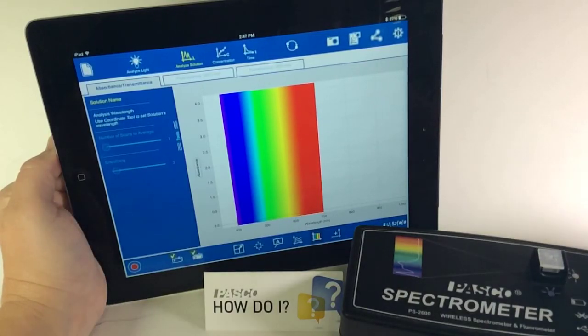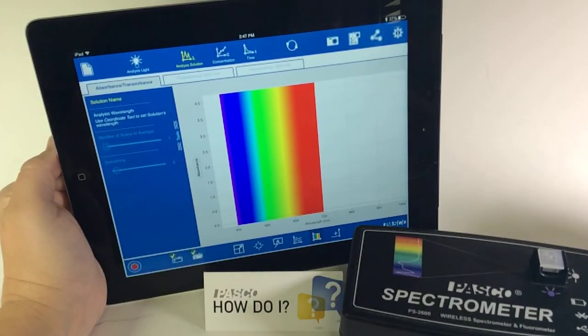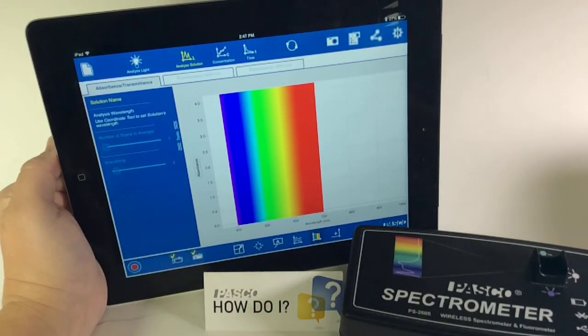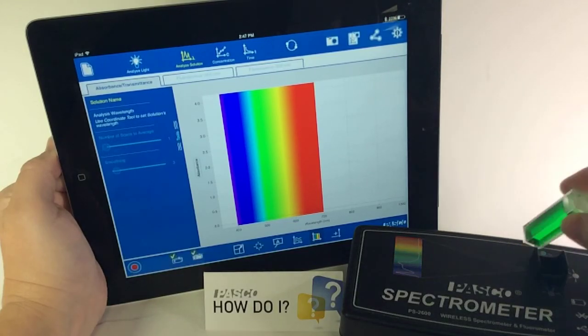I can replace the reference solution with the colored solution that I would like to analyze.